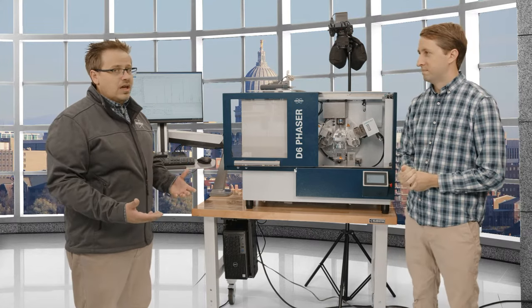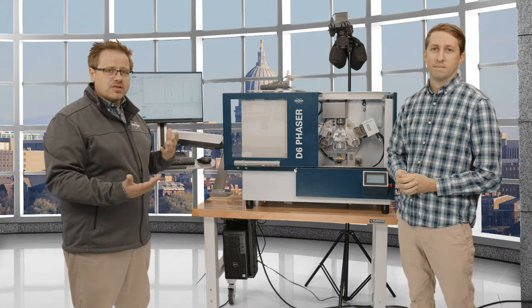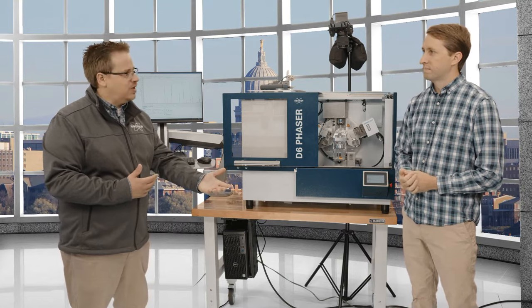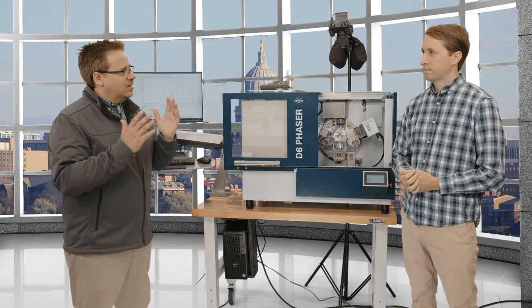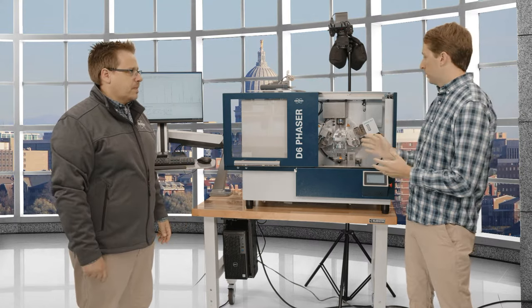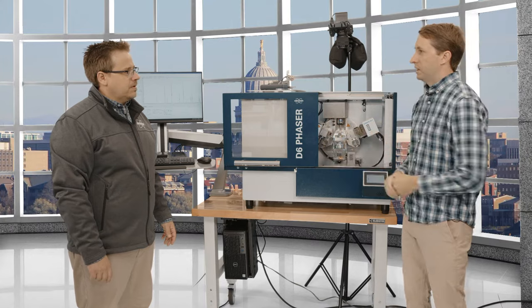That's right. And that's one big tip for everybody out there. If you're ever comparing measurements, it's not just about the power number. It's not about the intensity of a peak. You could scale that stuff. It's about signal to noise, signal to background, right? Right, and all of this comes with how all of these components are interacting together. It's about the entire system and the efficiency of it.